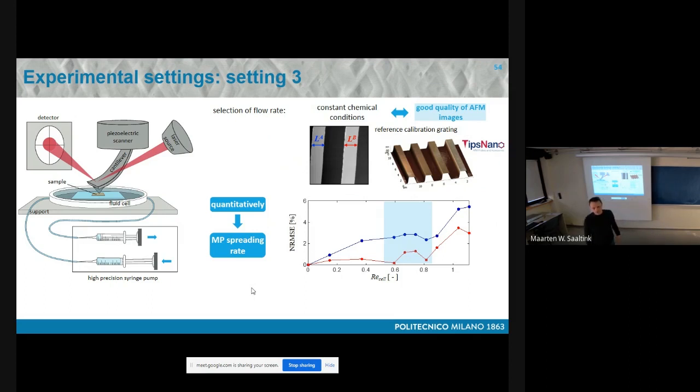I think that was basically a follow-up to the question. How can you relate what you see with what is actually there? You can measure the composition of the water. Yes, the key idea is also to couple the Raman capability in the near future. First, we want to solve these issues. What is this apparatus? It is in my department. It is already there. It's pretty new because it was delivered last September, October. So between October and now, it is still in the testing phase.